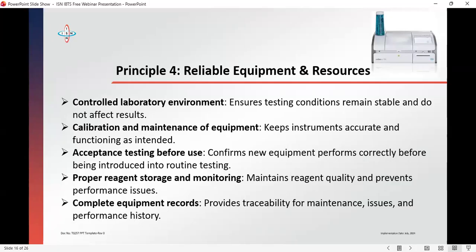Principle number 4, reliable equipment and resources. We've bought instruments. We don't want to come for the maintenance plan. That you do not maintain your parts is just like your instrument. It's just like you are driving a car without changing the oil. A syringe will bend because of wear and tear. The manufacturers, in their wisdom, even for your testing kits, you need to monitor them. You need to calibrate, as well as your pipette. Pipettes have yearly requirements for calibration.